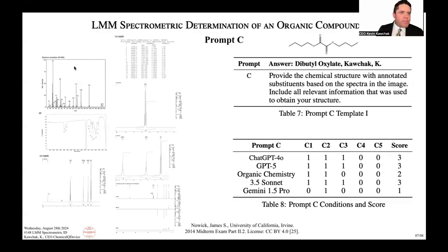I think it was the -29 and the 45. So anything in the mass spec didn't seem to rule this out. And the more conclusive things that I found are coming up. But with this carbonyl peak at 1735, that's more diagnostic of an ester, coming off of the CO double bond stretch.